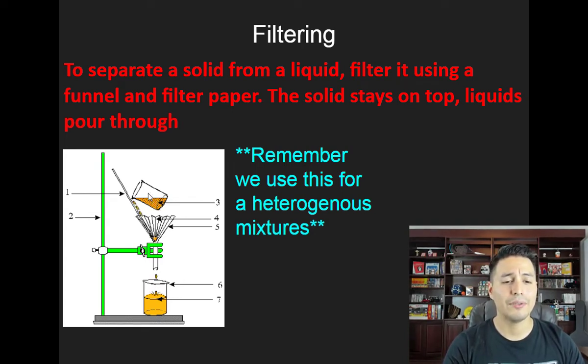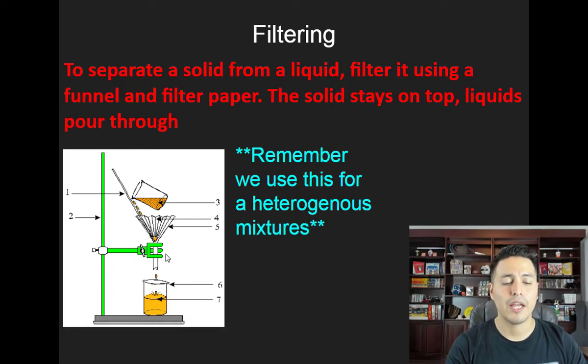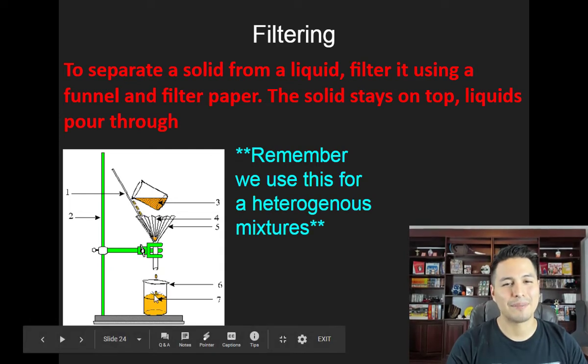Anyway, what I do is I slowly pour this liquid into the filter paper, and the filter paper is supposed to stop the solid particles from going through into the beaker. Now, if you've successfully done this, then you filtered it all out. But most of the time, we see that some of those solid particles, if they're small enough, crack through that little opening there and fall in as well. If this happens, then once again, you have to restart your whole system. So this isn't ideal.